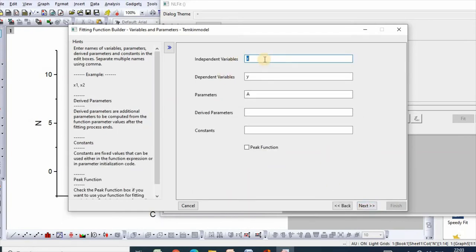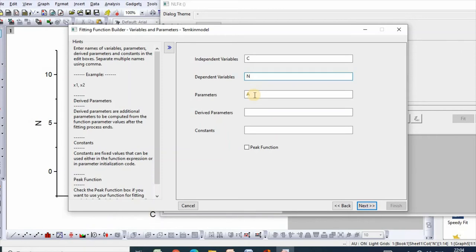Independent variable is C and dependent variable is N. Parameters are A and B. Then click Next.